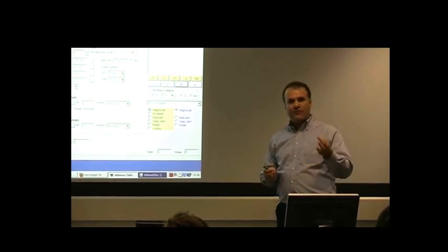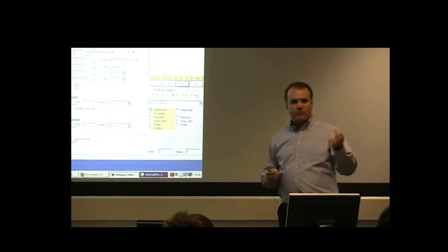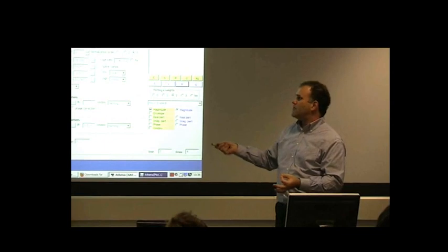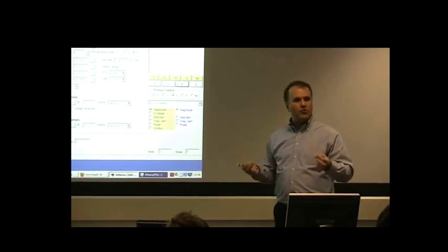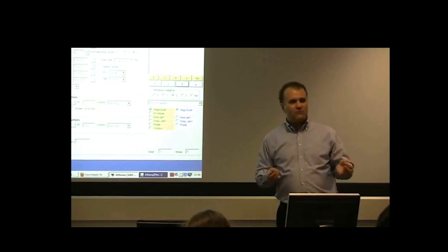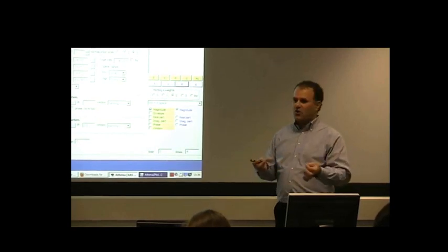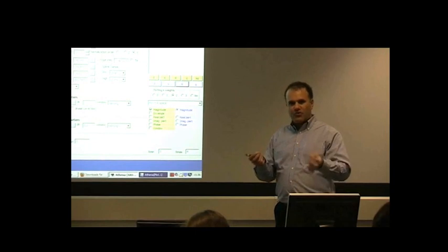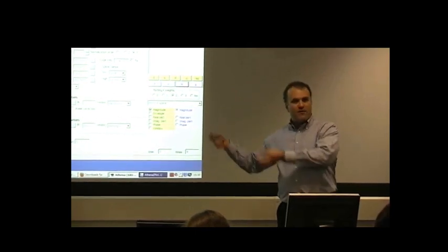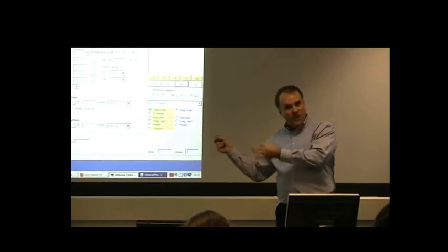And the difference there is the difference between aesthetics and statistics, right? Making the low R region look a certain way is an aesthetic argument. And I often joke at this point that if the aesthetic argument were the one that you wanted to drive your data analysis, well, you'd be better off using Photoshop than Athena. But that's not the criterion.